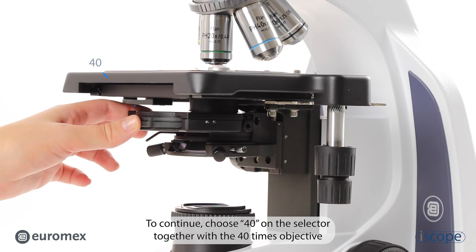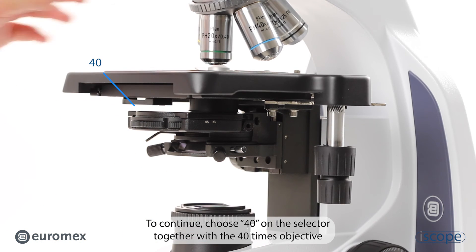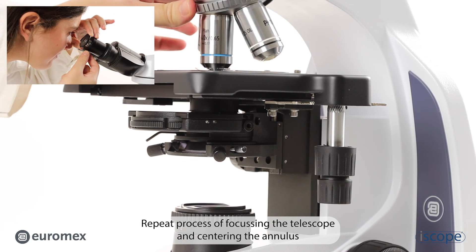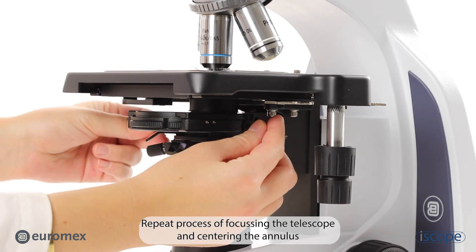To continue, choose 40 on the selector together with the 40 times objective. Repeat the process of focusing the telescope and centering the annulus.